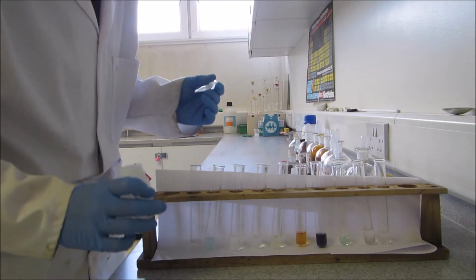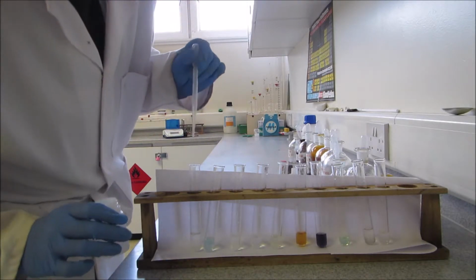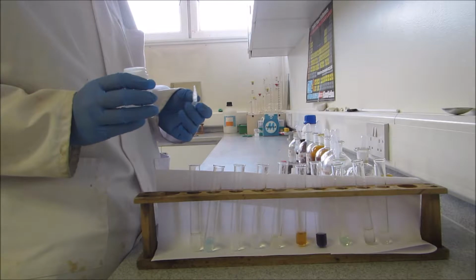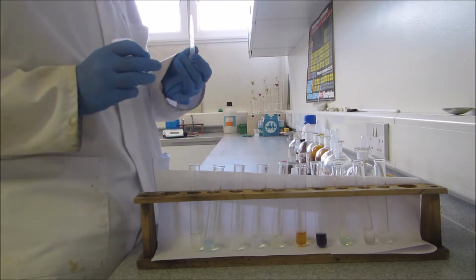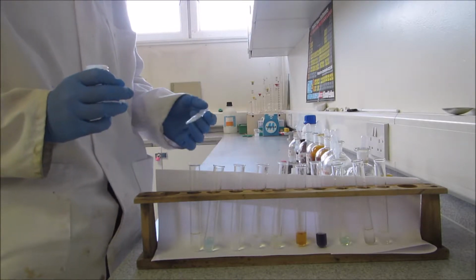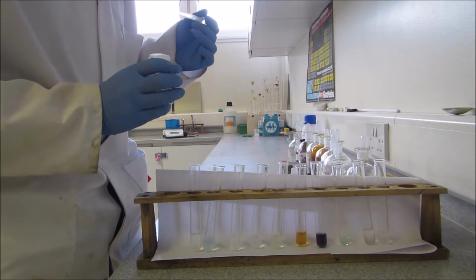So the first one is sodium chloride, and when I add sodium hydroxide, essentially there's no reaction. So anything that doesn't form any precipitate with sodium hydroxide can either be lithium, sodium, or potassium. To actually identify between the three and to work out it's sodium, I'd have to do a flame test, and the flame color would be yellow for sodium.